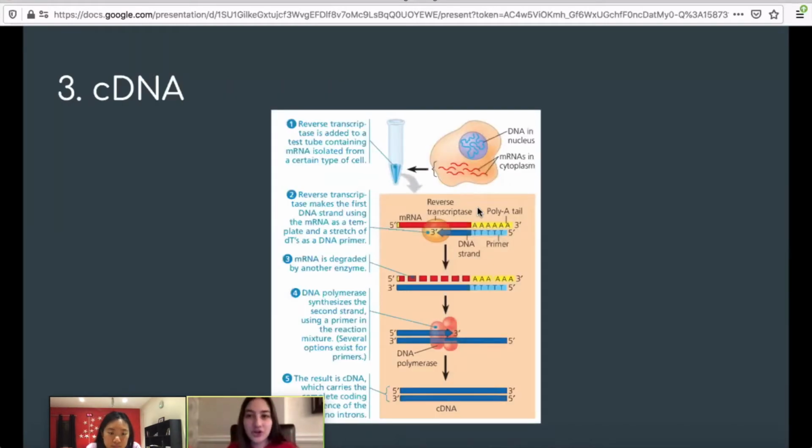So as Yanlin mentioned earlier, there are lots of different ingredients in this mixture. And let's just say that there's a little analogy I'd like to make to explain something to you. You have a certain document in a room, and this room is locked. You can't take anything out, but you need what's written on that document to be copied into more components, so into different pieces of paper. And again, how are you supposed to copy that when all of these documents are sealed in this locked room?